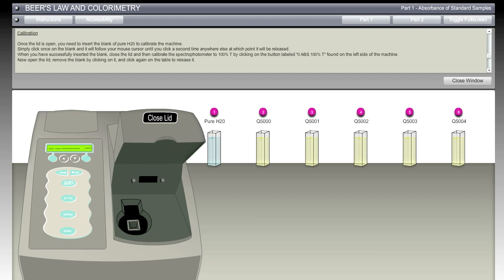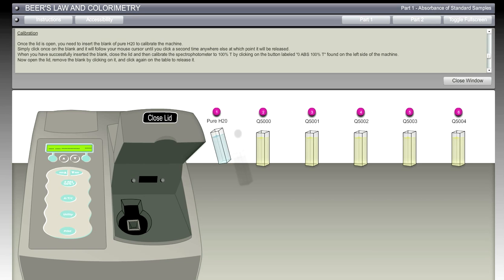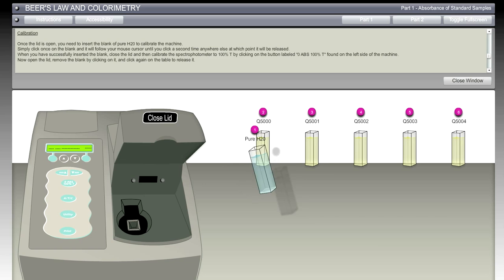Now the lid is open. We're going to grab the blank of pure H2O to calibrate the machine. This is something they would do in class - they would always calibrate the machine upon starting it up. You can click on the blank and it will follow your mouse cursor until you click a second time, at which point it will be released.